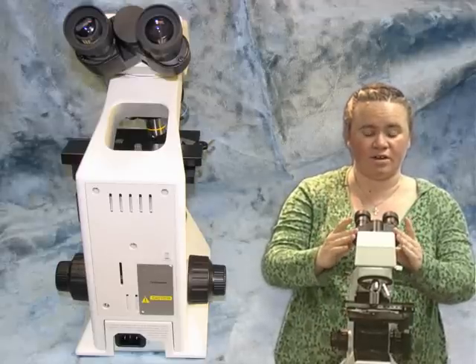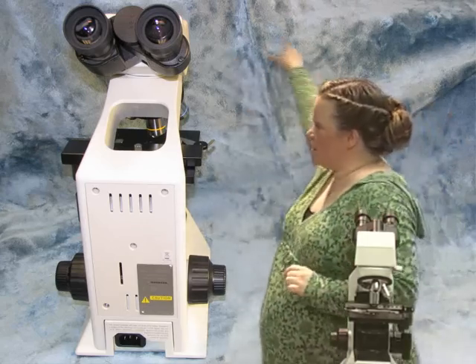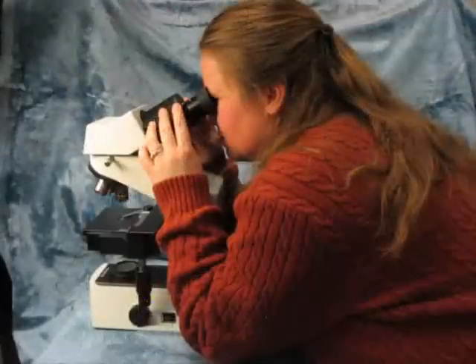The second thing we're going to adjust is your interpupillary distance. We're going to do this by using the eyepieces right here. There's a round circle that you can see in between the eyepieces here, and this is where we're going to look at what your actual interpupillary distance is. To do this, grab onto the sides of the eyepieces, put one hand on each one.